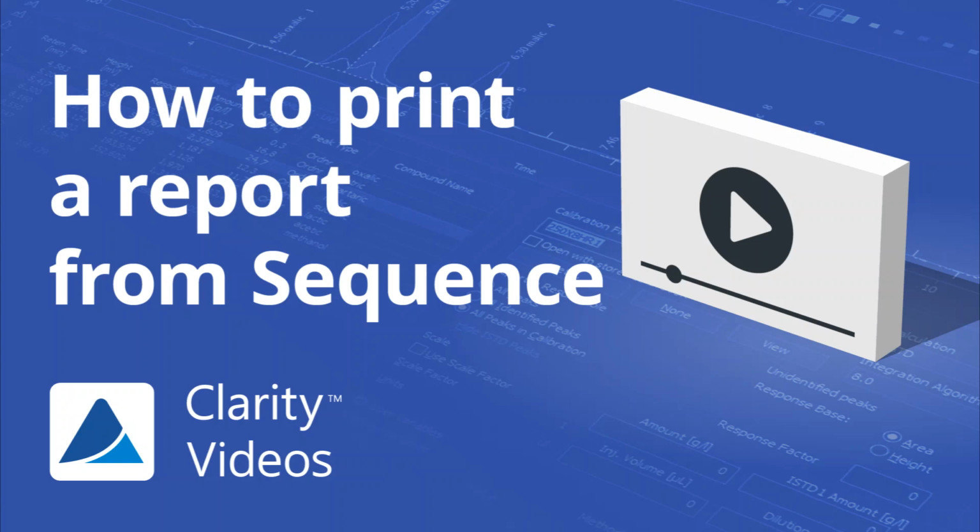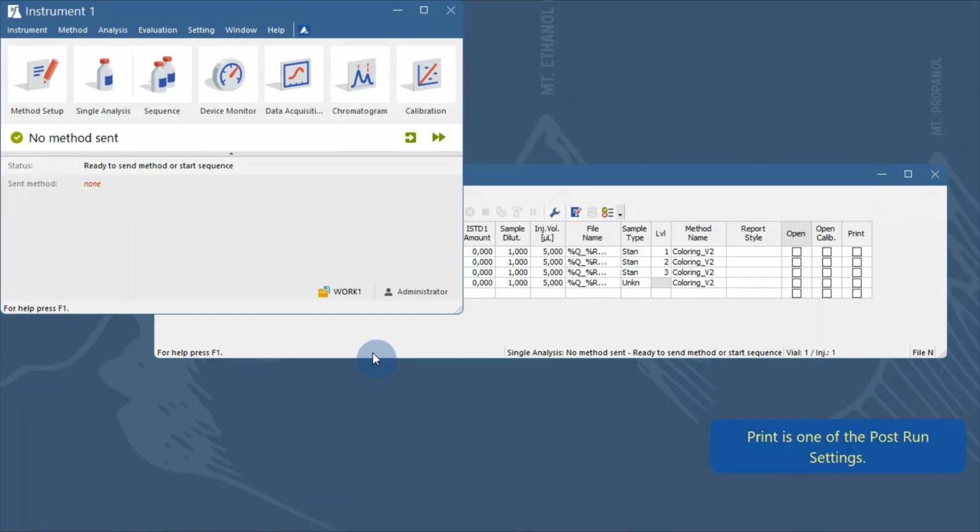Hello, in this video, I will show you how to print a report immediately after a measurement is finished. In Clarity, printing is just one of the actions that can be performed after a measurement. These actions are collectively known as post-run settings. You can find them on a specific tab in Single Analysis.